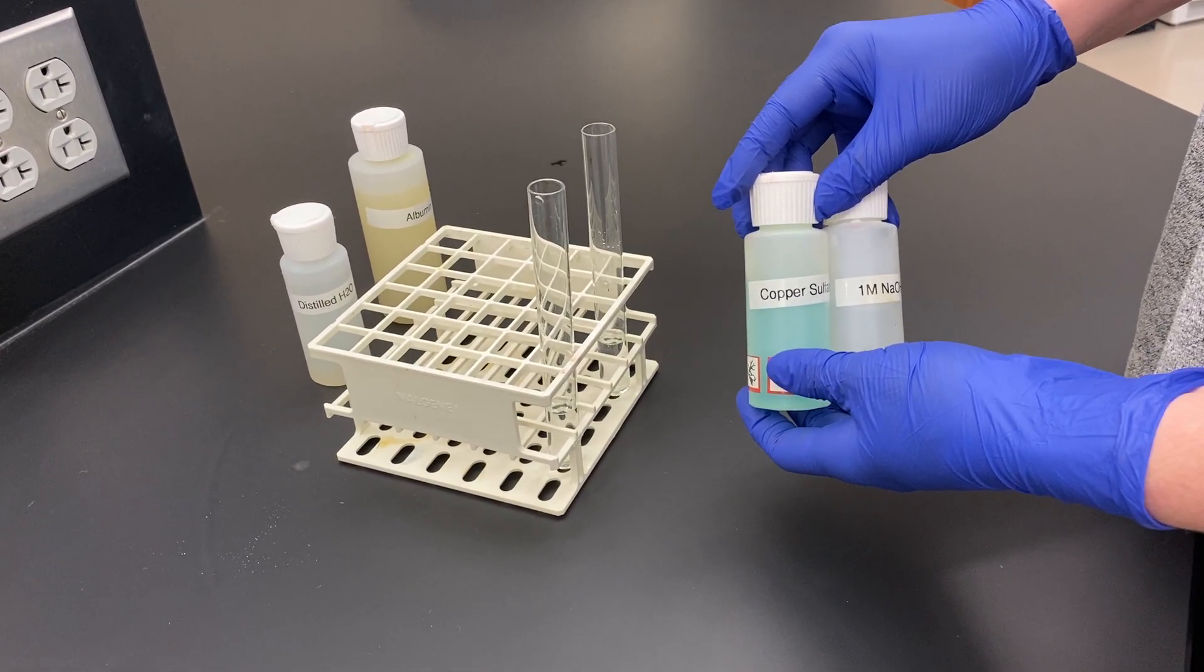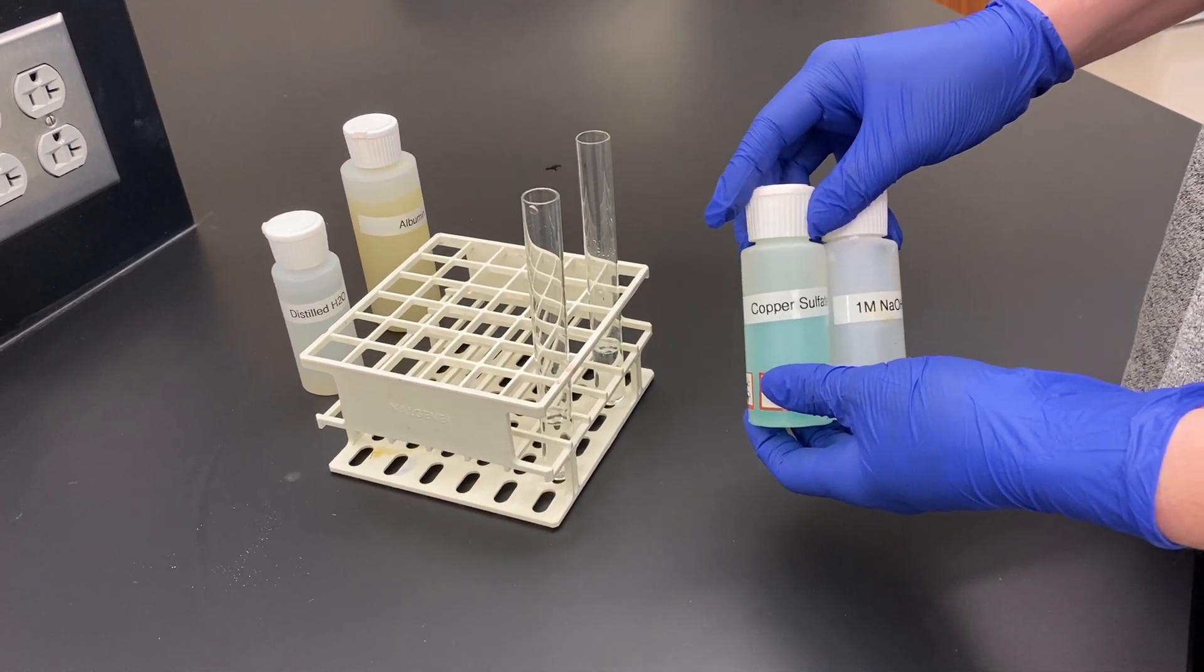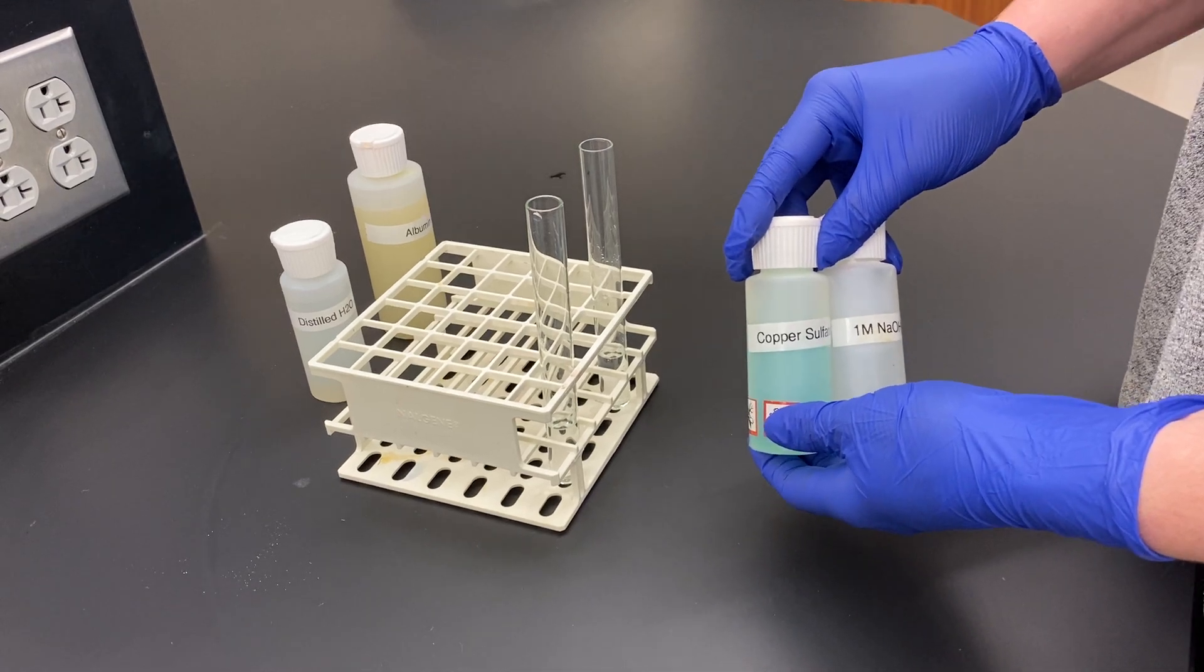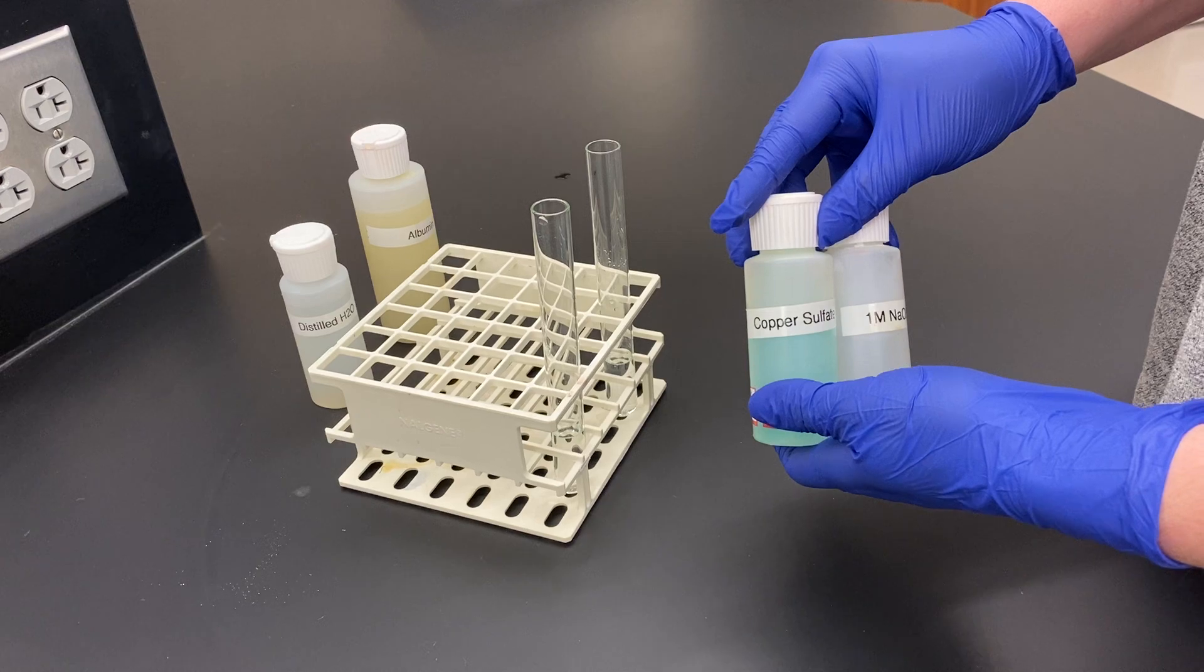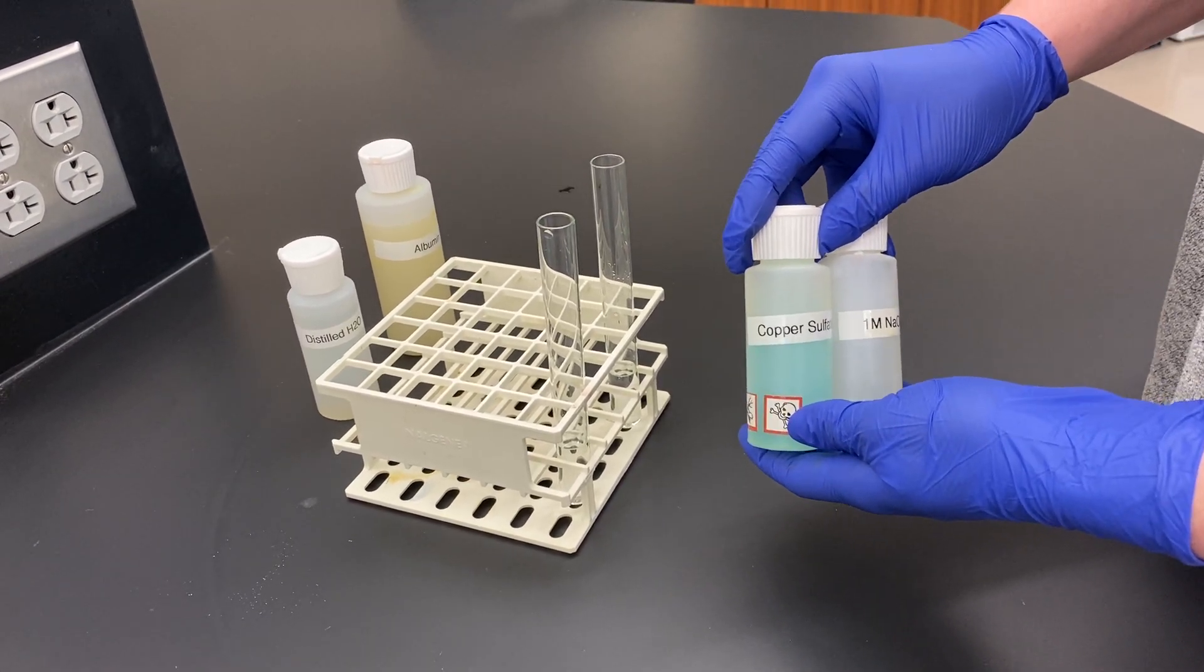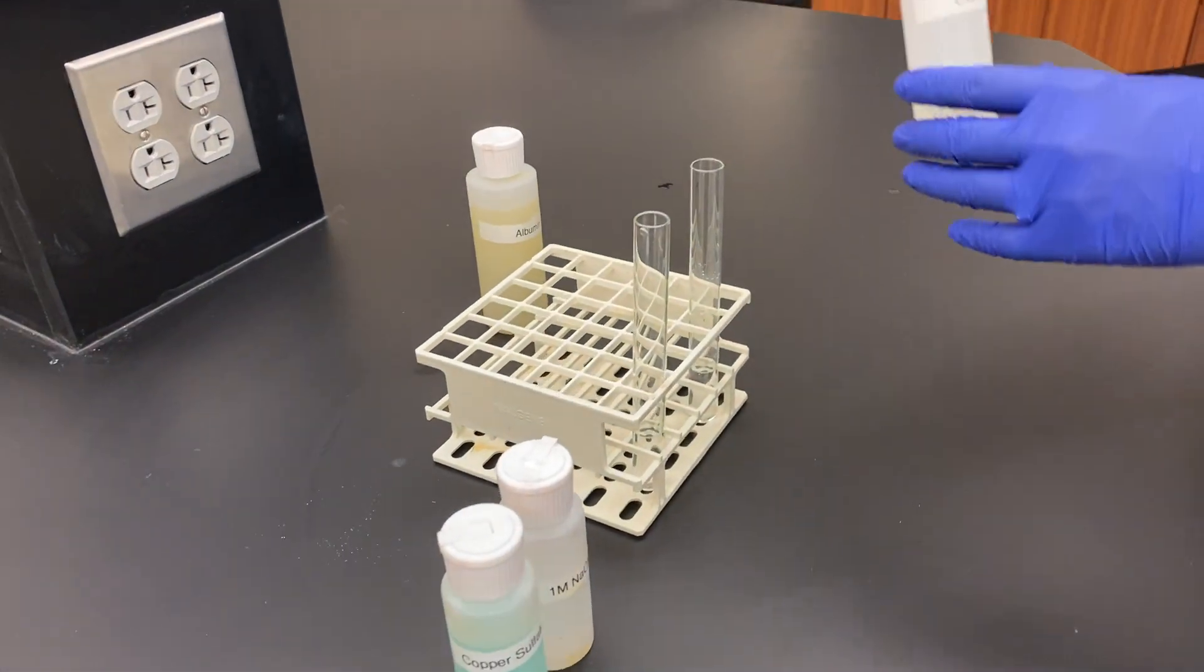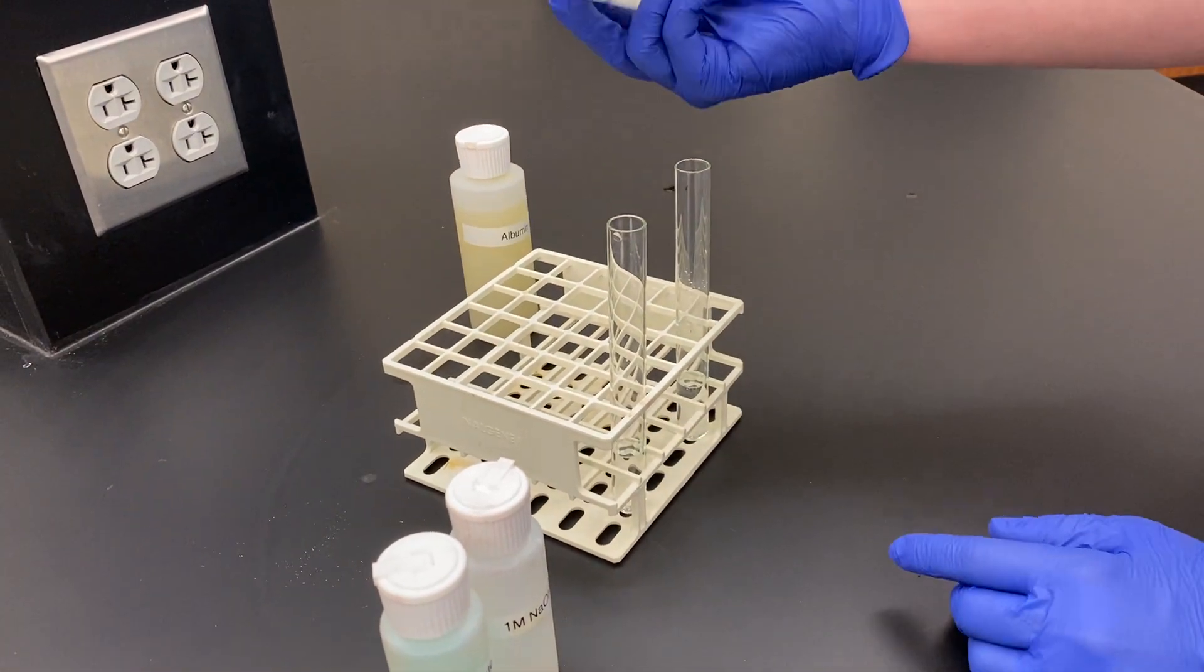We're going to be able to examine the extent of peptide bonds, or the amount of proteins within our sample, based on the deepening of that color. The darker that color, the more proteins, the more peptide bonds are present in that sample. What we're going to do is add the samples first this time. We're going to add DI water for our negative control, 10 drops.